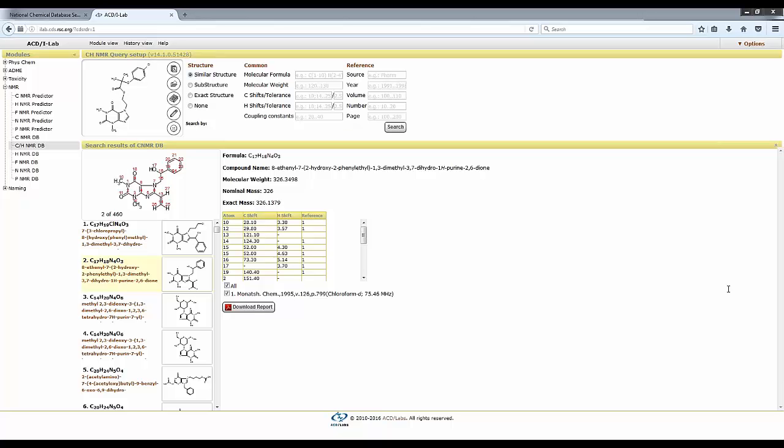The problem is that even though in principle you could use these methods for predicting chemical shifts for bigger molecules, if you go for bigger molecules, then it is mostly through space effects that dominate the actual observed chemical shift rather than the through bond ones that are used here. So in reality, you can. I've tried with small peptides, and they work maybe up to 9 or 10 amino acids. So that's probably the maximum you can go. You cannot enter, for example, a protein. Other questions?